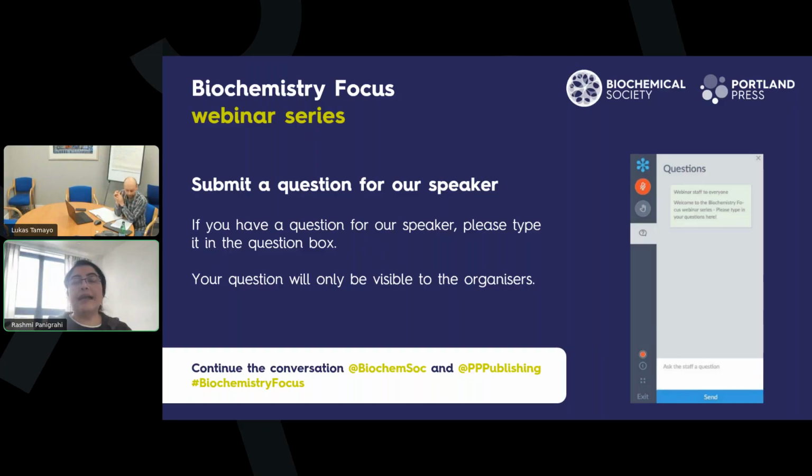I am not sure if this is biologically relevant, but this is how the crystal packing works, and they're generally stabilized by ions, right? So it's charge-based interactions and a pretty nice fit, and also high resolution structures.